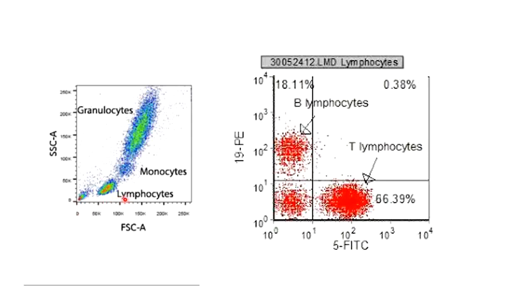This is the debris which comes because of our experimental procedure. Then we have a population here, and this is the population of what? Lymphocytes. Then a smaller second population, which is the population of monocytes. And then this third population, which is the population of granulocytes. Why do granulocytes come here?